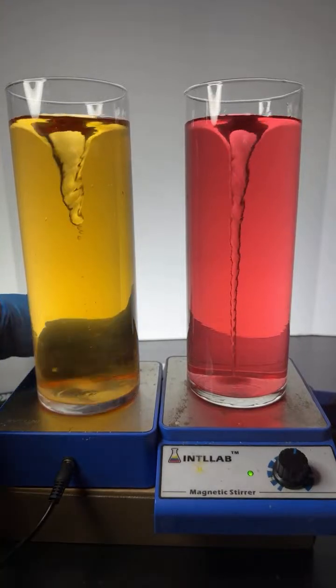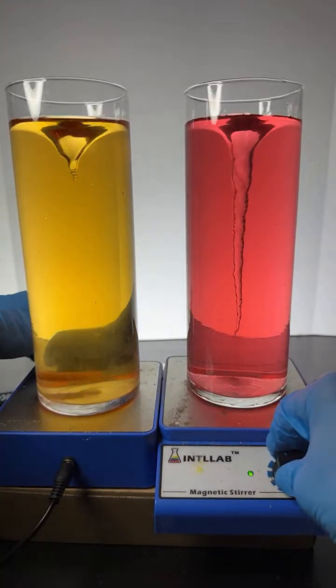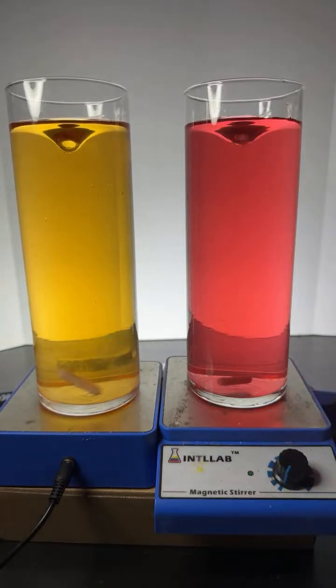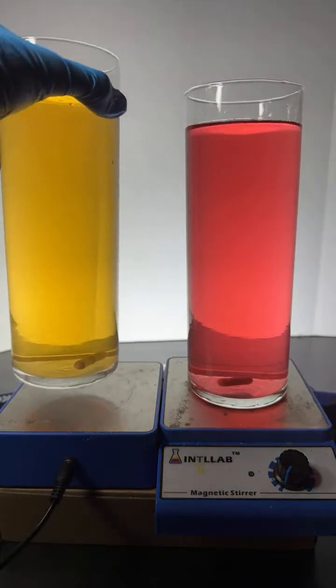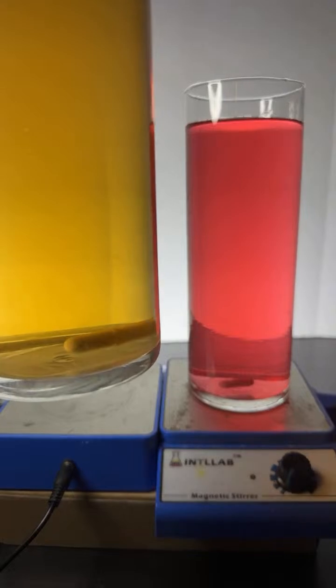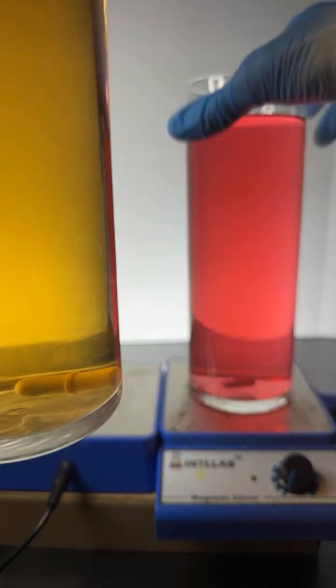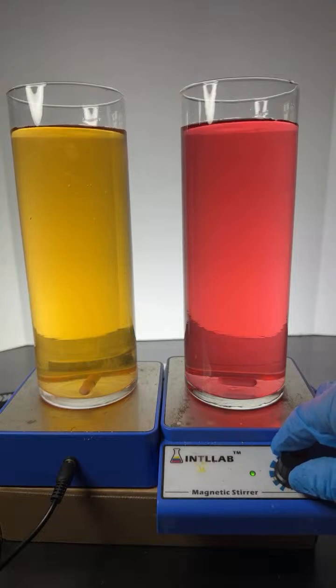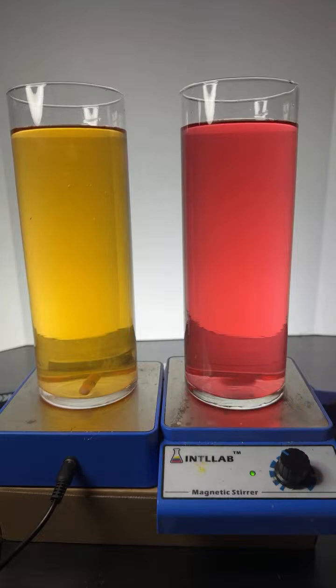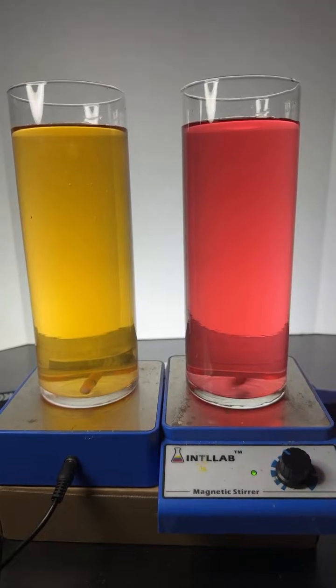I'm going to turn both of them off, and I want you to look at the size of the stir bars in each. You'll notice that the stir bar in this flask is much bigger than the stir bar in this flask. And so the size of the funnel depends on two things. It depends on the size of the stir bar and how fast I spin it. So here, I'll get this one over here on the right spinning kind of slow, and then we'll speed it up.